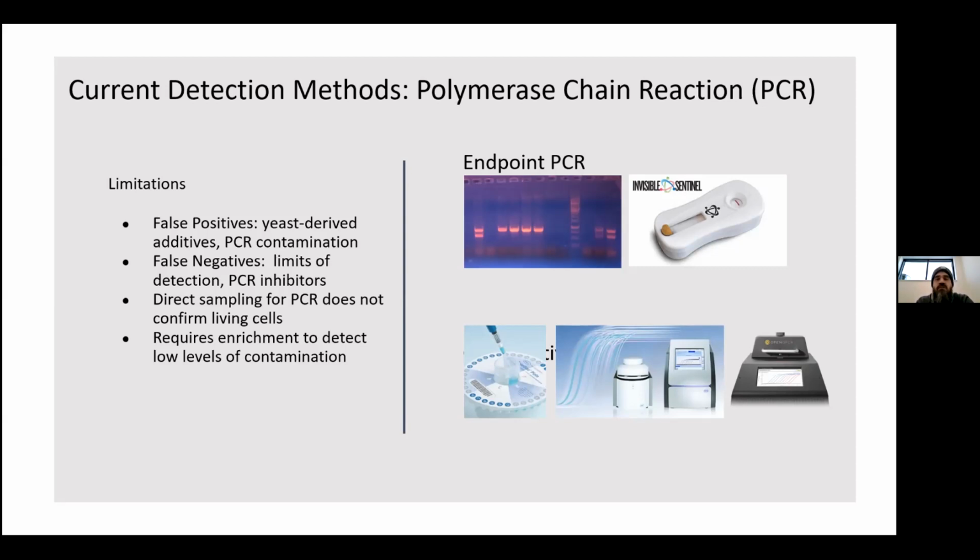So I love this story because I think it gives you a good indication that all these methods work in tandem. I don't think microbiology is the be-all end-all because it takes a little longer. You have to wait for things to grow on these plates, whereas the genetic tests are very, very fast. You can have a result in a few hours. But again, the genetic results have flaws too, in that there might not be live yeast there. So these methods really complement each other. And if it's up to me, you use both of these methods because they both have utility.